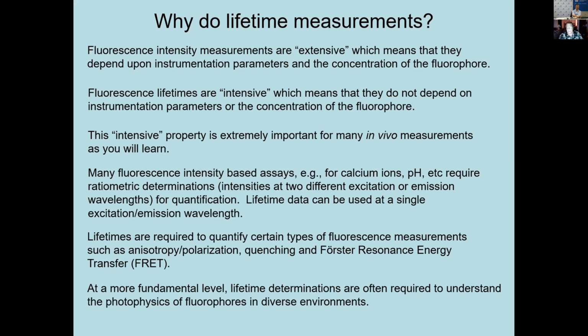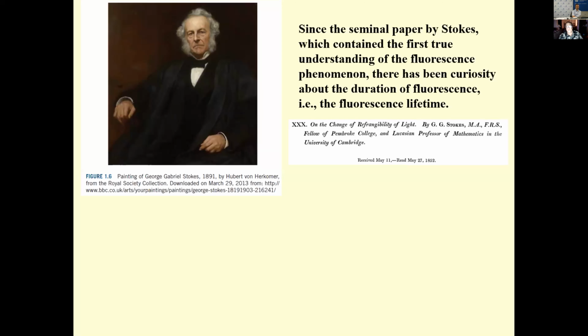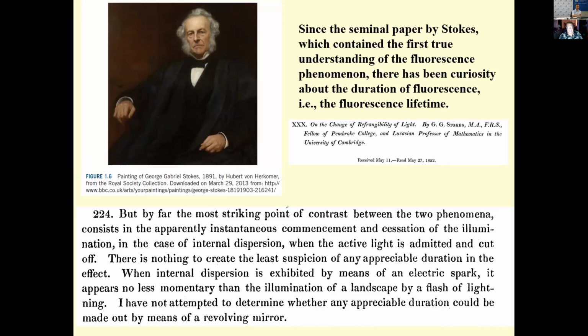At a more fundamental level, lifetime determinations are often required to understand the photophysics of fluorophores in different environments. So I'm not going to go into a big history thing. I'll do that on Thursday, but it is interesting that one of the first really seminal papers was by George Stokes, who was the first to really start to grasp the meaning of fluorescence phenomena. And I'll tell you more about this paper on Thursday.